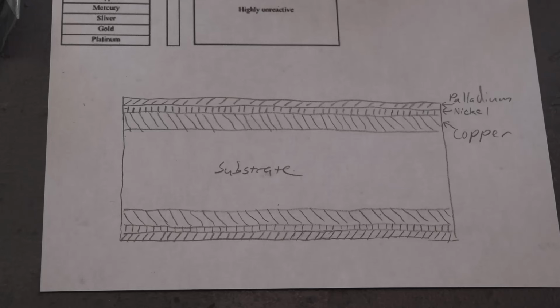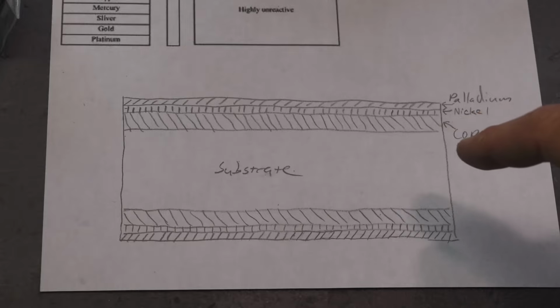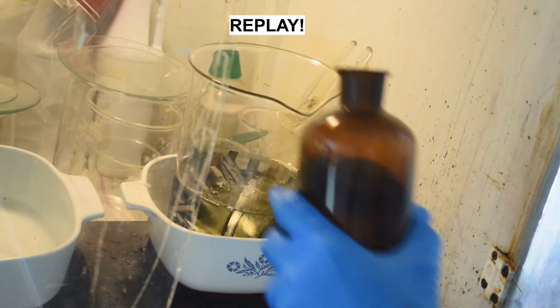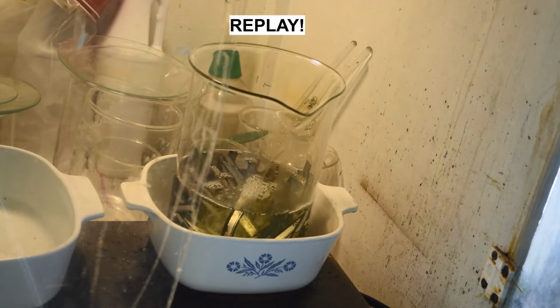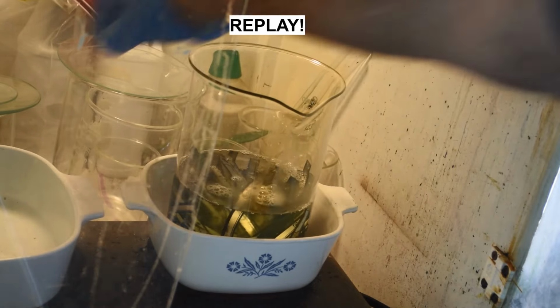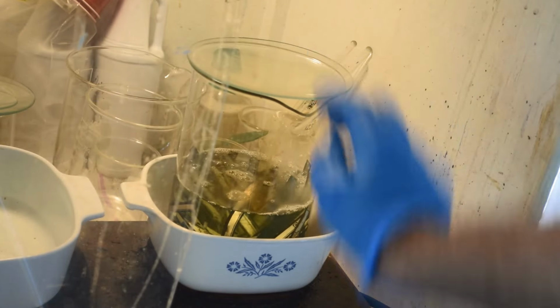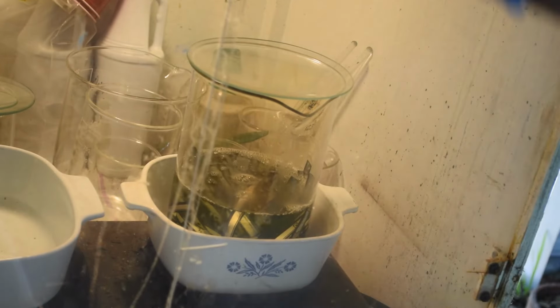So I put these in a beaker, and I put some dilute nitric acid on them, and we initially had a really strong reaction. I'm just going to sort of eyeball it a bit. Whoa, hey, we got us a reaction going on. Look at that. Put a watch glass on it.